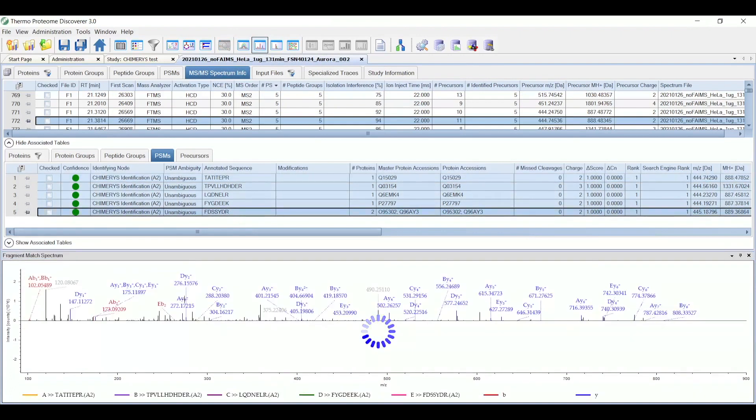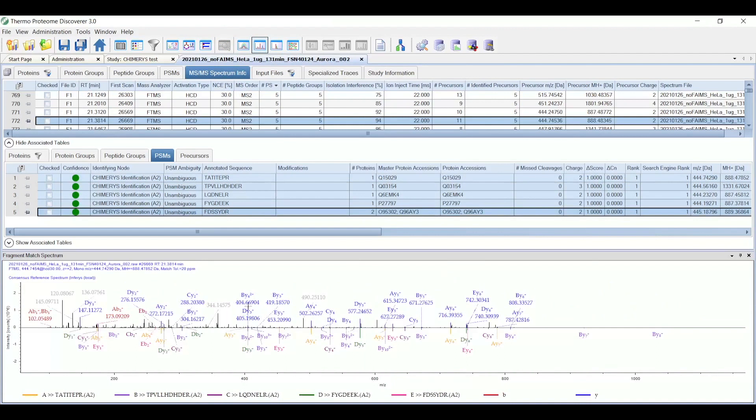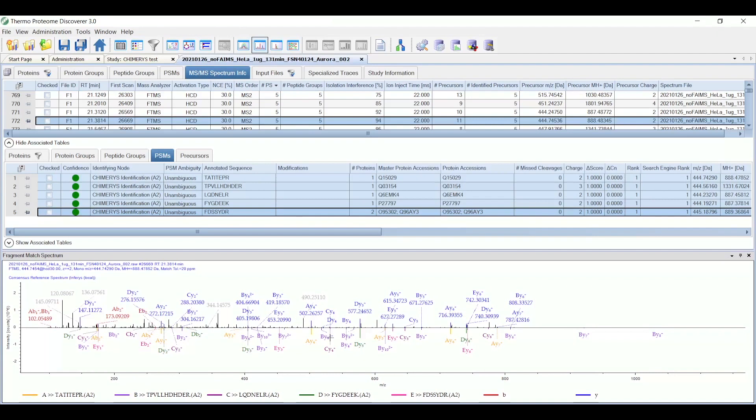there's an annotation A, B, C, D, and E. These are the five peptides here. The legend down below says which one is A, B, C, D, and E. And then the predicted spectrum for all five peptides are shown together in the MSMS spectrum. So you'd use this to help validate that the Chimeris result of all the peptides together match the input spectrum as closely as possible.